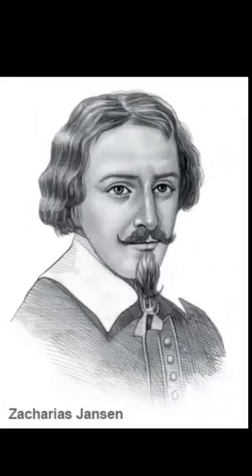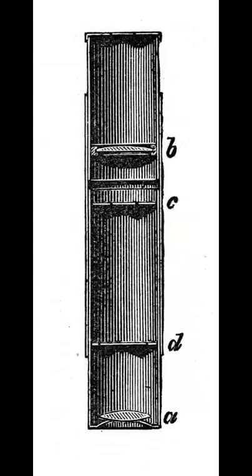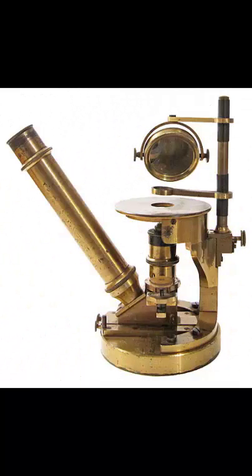The history. A Dutch spectacle maker named Zacharias Janssen invented the first microscope in about 1590, merely a series of lenses in a tube. It was the forerunner of today's compound microscope. A light source was added by Anton van Leeuwenhoek and the lenses improved in the late 1600s. However, until 1800, there were few major improvements in the light microscope. Then, in 1850, John Lawrence Smith, a faculty member at what is now Tulane University, invented the inverted microscope.